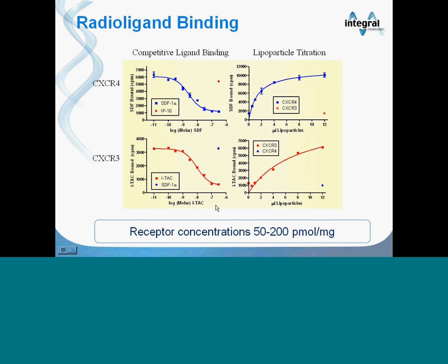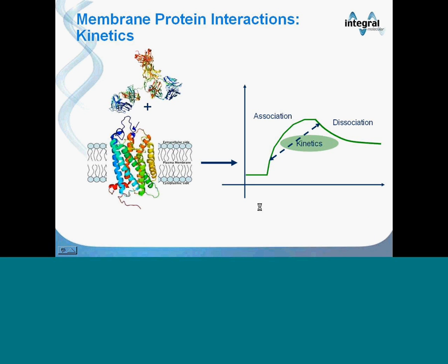They've been of limited use, however, with membrane proteins because cells are too large for the microfluidics, and reconstitution of solubilized membrane proteins on the chip surface is a labor-intensive and empirical process. As I mentioned before, because of their small size, lipoparticles are ideally suited for microfluidic applications, such as SPR biosensors.